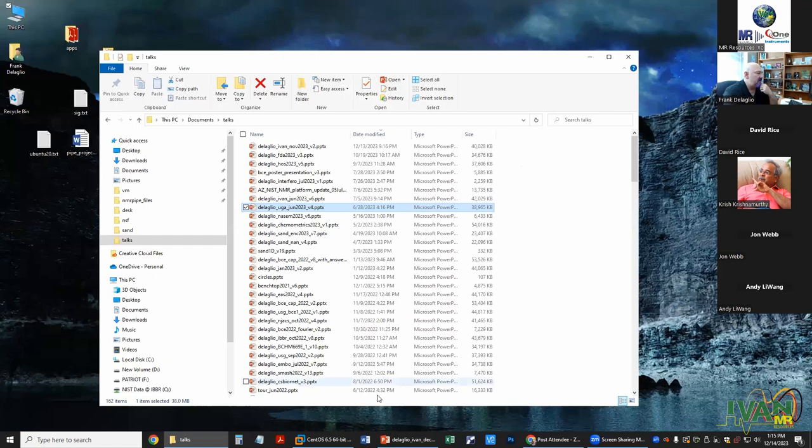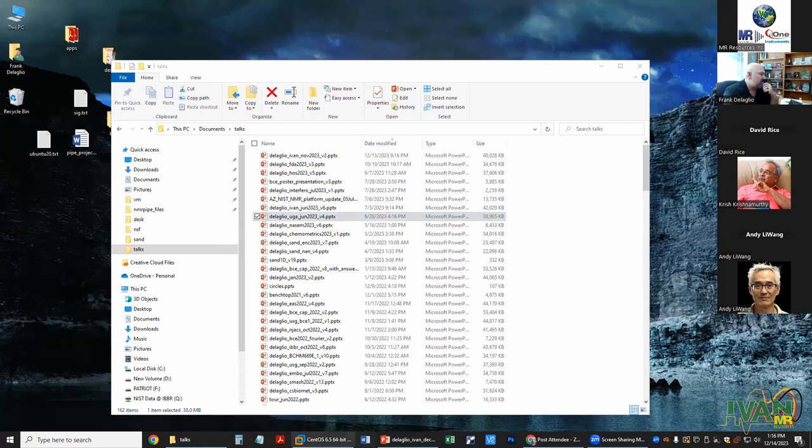Sure. All right. Thanks. This is great stuff, Frank. I have a question. Is there a way to interactively assign the backbone of a protein with NMRDraw, using the standard suite of an HSQC, HNCACB, HNCOCACB, HNCA, et cetera? There are some tools to do this, but honestly, I wouldn't recommend it, because they're not really very polished, but I can give you an idea of what they look like when we're done with this part of the demonstration.